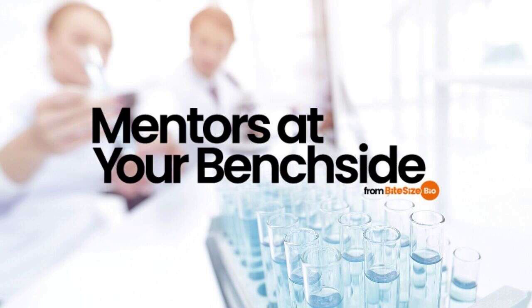Another way to ensure you know where your pellet is when using a fixed angle rotor is to load your tubes in an identical way relative to the centre of the centrifuge. Then your pellet should always be in the same place. Keep an eye on the spot and look for the glassy material. Sometimes this is difficult because many people use the Oak Ridge plastic tubes, which are opaque.